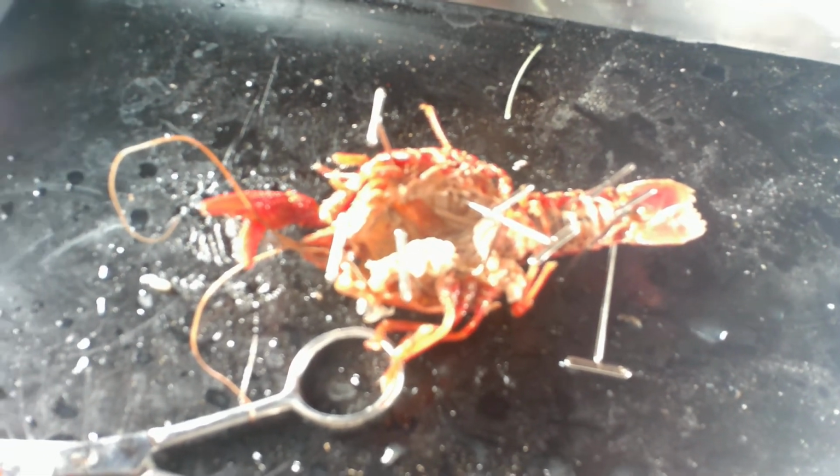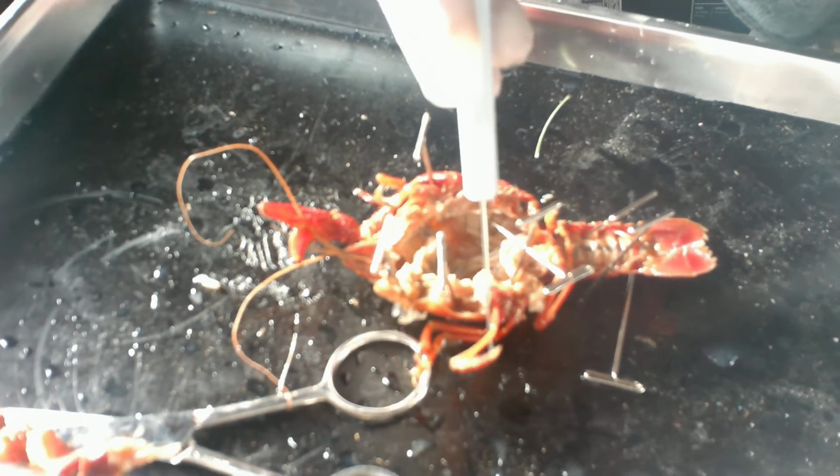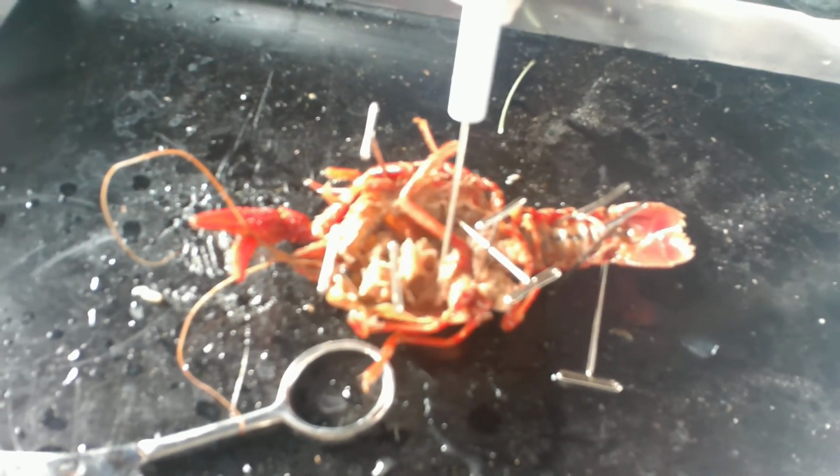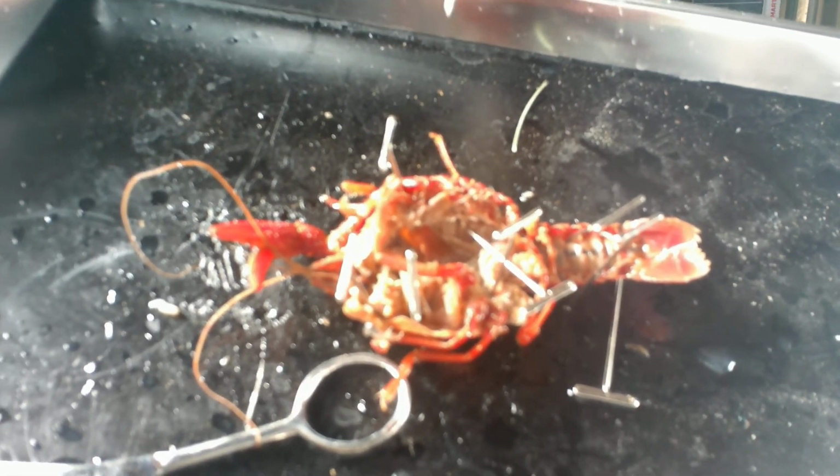So we already talked about the mouth, the eye, the esophagus, the gills. We already showed you guys those externally. But if you lift up the legs, you can see the gills again right on the side here. So I apologize, the picture's kind of grainy. Doing the best that we can.